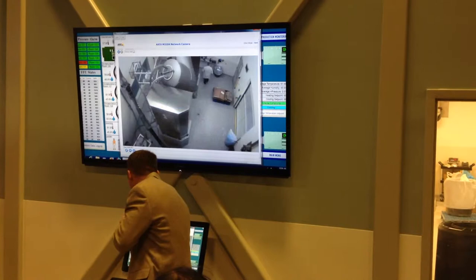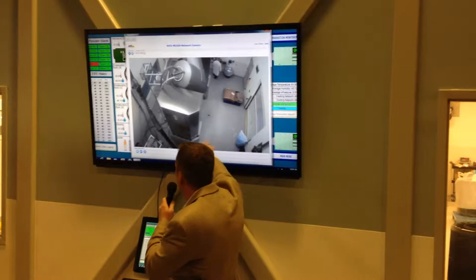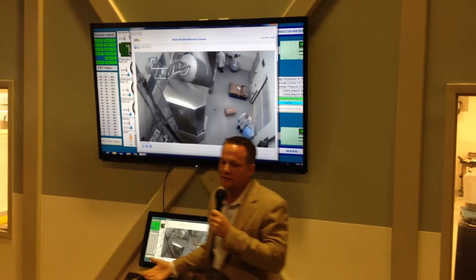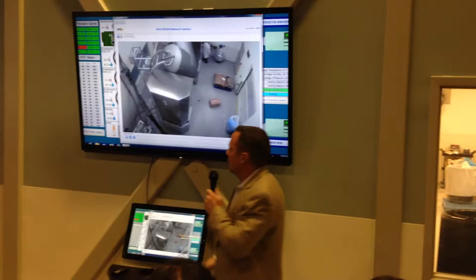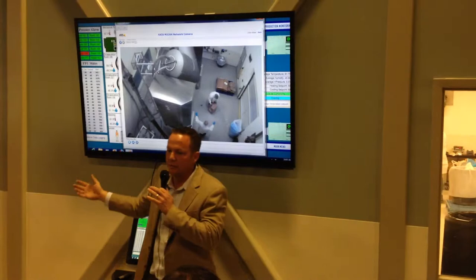This is our blender — a 60 cubic foot working blender. The products are actually being vacuum-transferred up to the top of the blender. It costs a lot of money to get this vacuum-transfer system, but most companies carry products up the staircase and dump in the powder. We don't like that because if they spill something and don't know what it is, you don't get a consistent, high-quality product. With the vacuum-transfer system, the spill rate is almost non-existent. Each product also has its own set of tubes that are clean and sanitized — we never use XM Plus tubes with XM AM tubes, or XM Smart Mix with XM Plus. We never use the same tubes.